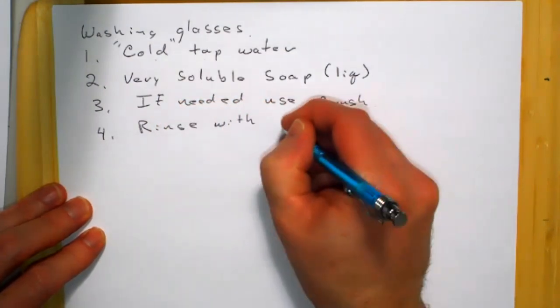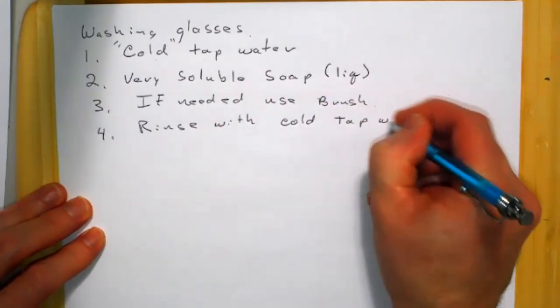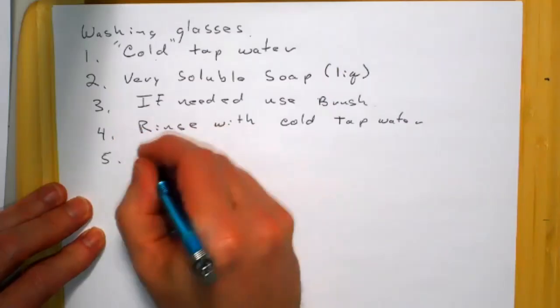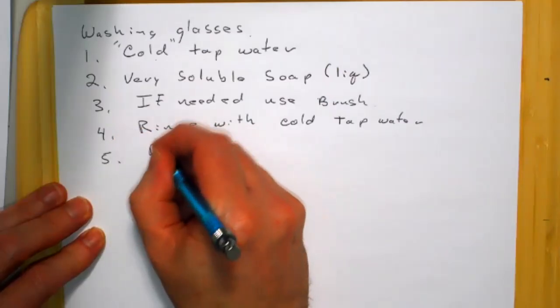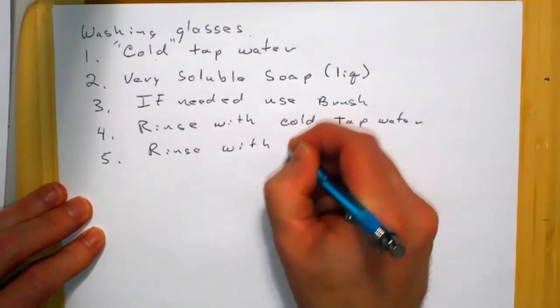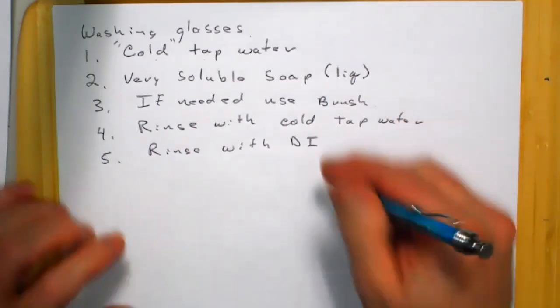And this time definitely cold tap water. And then you finish with a rinse with DI. The deionized water taps have an automatic shut off.